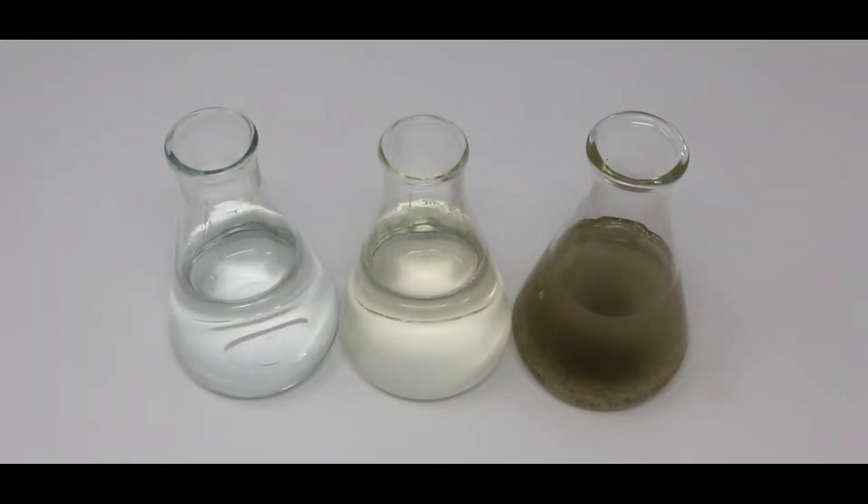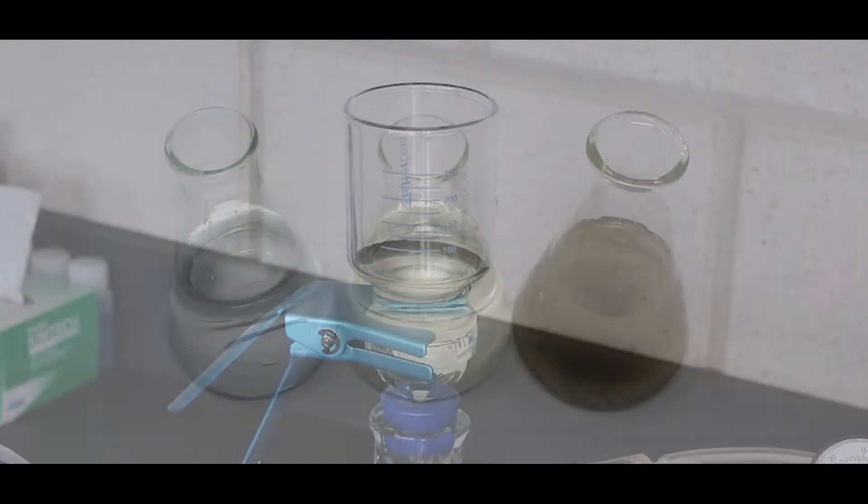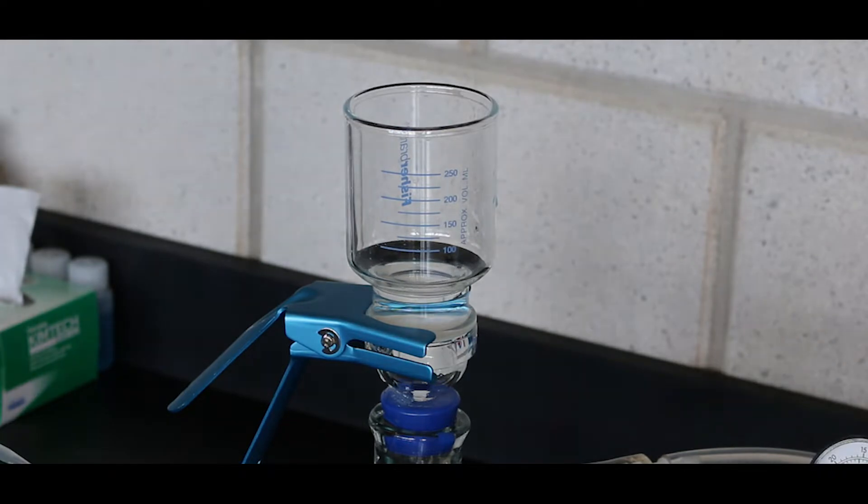Apparent color is the color of unfiltered water. True color is the color of water from which suspended matter has been removed by filtration.